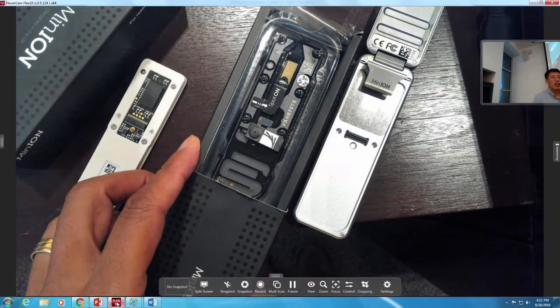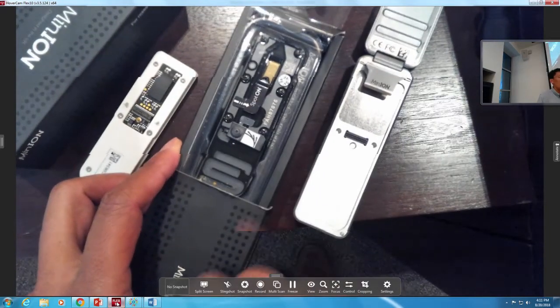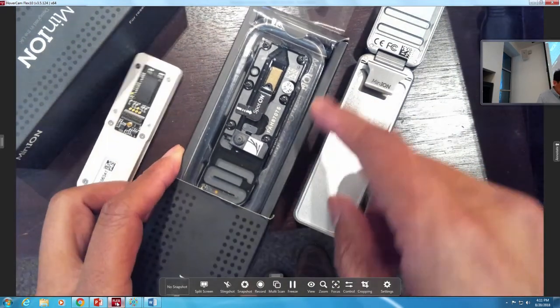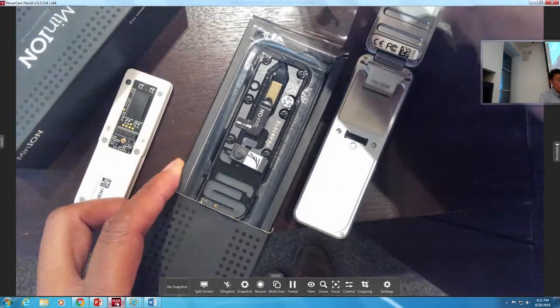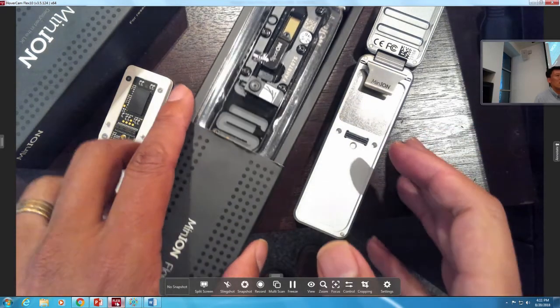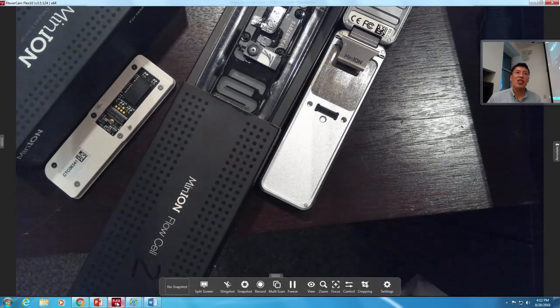So basically, you remove this. Normally, before it's used, it's being frozen in the freezers. Once you thaw it properly, you just load your samples into this whole thing, then put it in and plug it into your computer, and then the signals will start to flow out, okay?